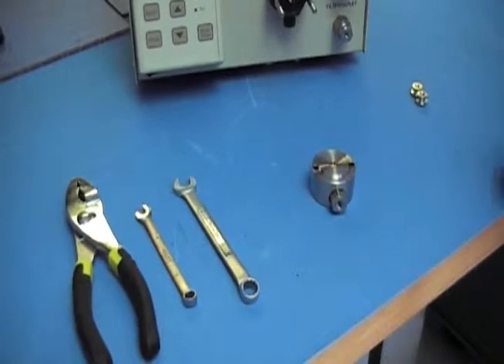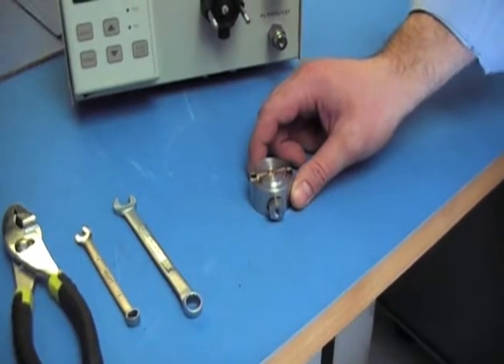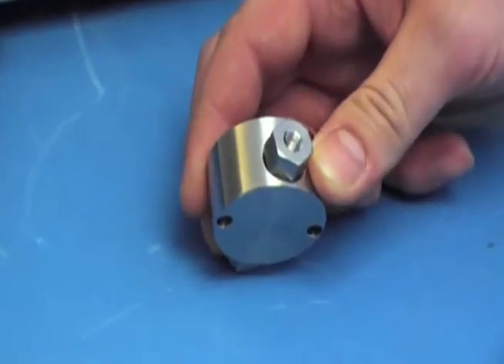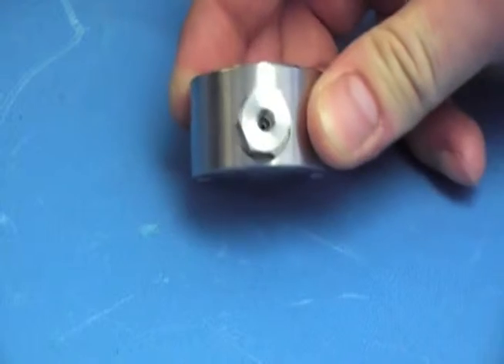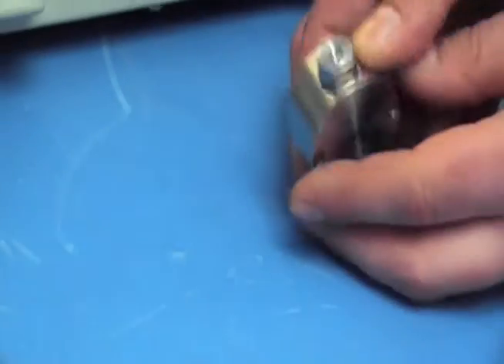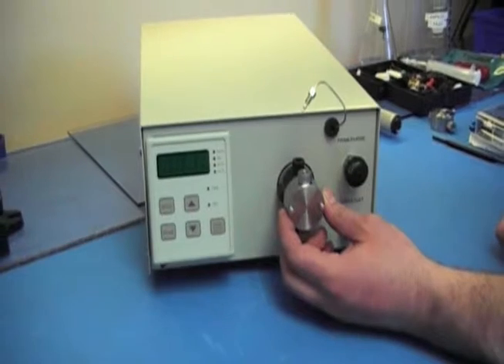After installing the new seal and/or installing the new check valves, you've got to put the head back on the pump. Before you put it on, make sure you have the right orientation so your flow path is correct. The inlet is always the bigger of the two ports, and the outlet always goes up. After you figure out the orientation, slide the pump head back on and wait until you can feel it pressing against the piston.